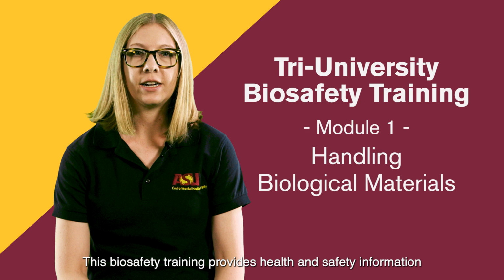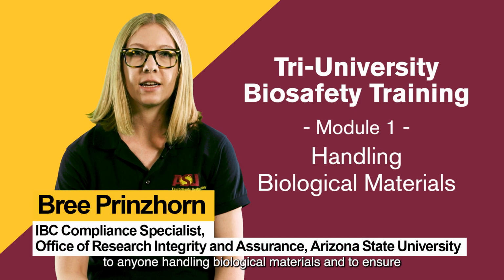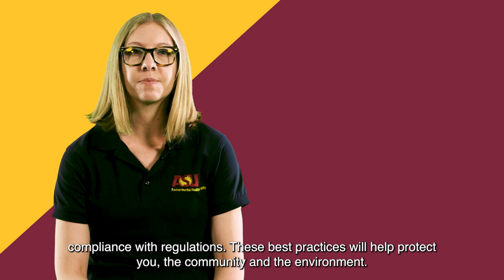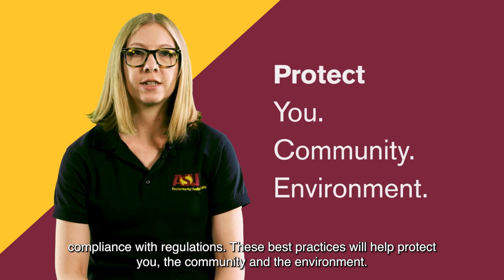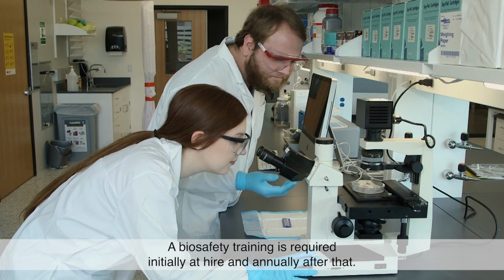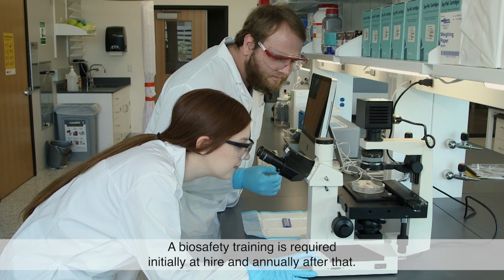This biosafety training provides health and safety information to anyone handling biological materials and to ensure compliance with regulations. These best practices will help protect you, the community, and the environment. A biosafety training is required initially at hire and annually after that.